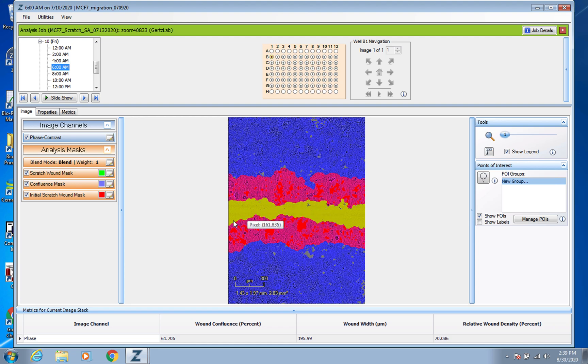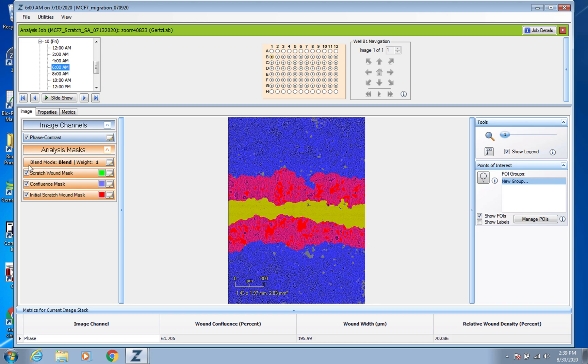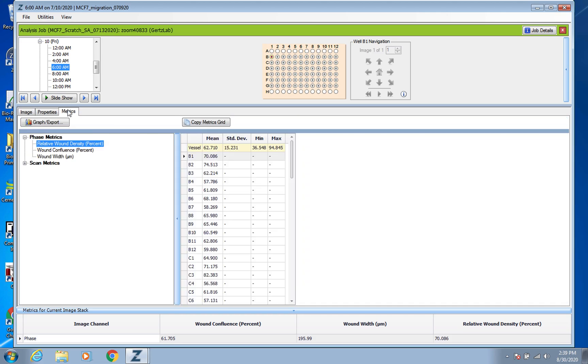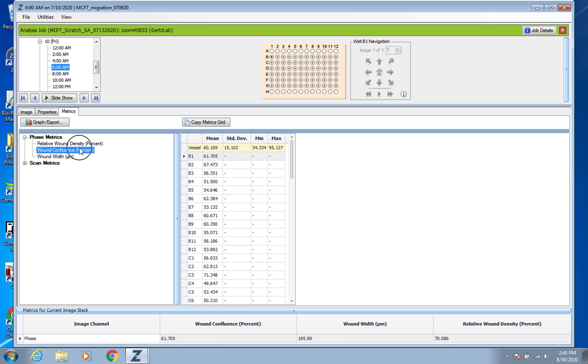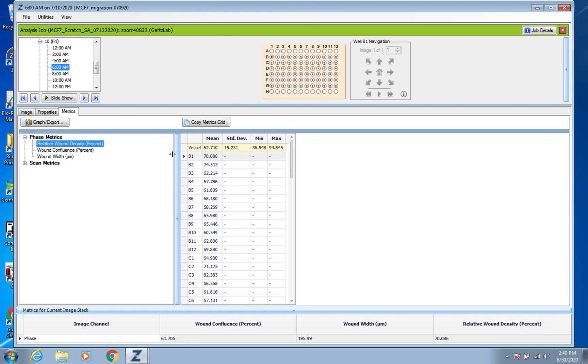So it's all going to start at zero, right? So you again go over to Metrics and you're going to want this Relative Wound Density Percent here. You could also use Wound Confluence, but we normally use this Relative Wound Density since it's kind of relating back to the original scratch wound instead of taking into consideration debris or cells that were already there. So that's kind of the best option.